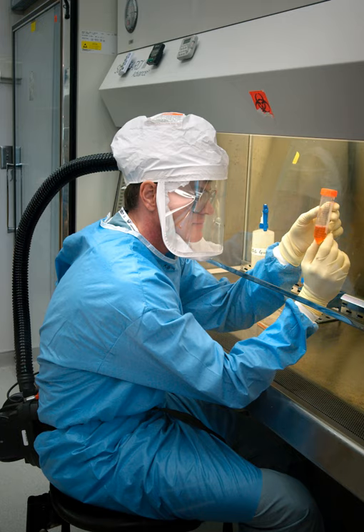Changing the filter should be limited to trained persons, as the filter is potentially contaminated. This can be done either after the cabinet has been decontaminated using a gaseous procedure using formaldehyde, chlorine dioxide or vaporized hydrogen peroxide, or a bag-in, bag-out procedure. When a UV light is used, this lamp should be checked and changed as well. UV lights decrease in power over time, resulting in diminished disinfection of the working area.